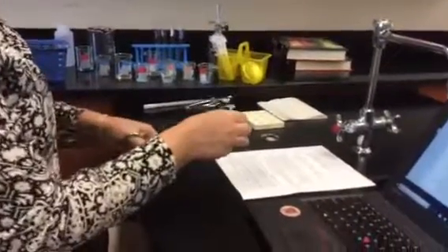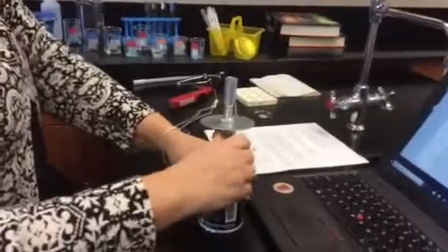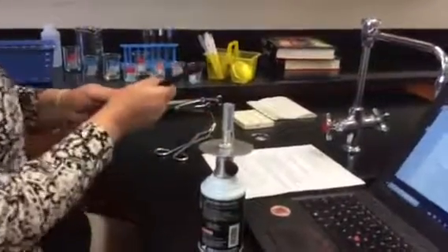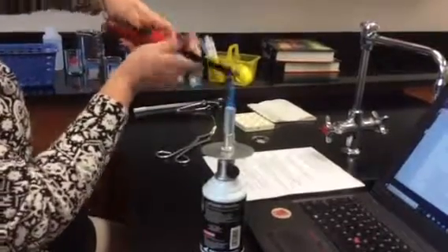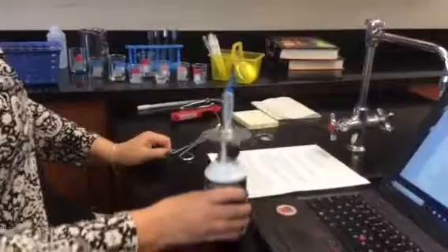All right, so then obtain a small piece of magnesium ribbon. And you're going to use the spot plate again, so just keep it to the side. All right, magnesium is here, and we're going to hold it with some tongs. And these are the tongs that you're going to hold it with, like so. And you're going to get your butane until you hear the hissing sound, and light it with your lighter. You can do it. And it says until you get a nice blue flame.